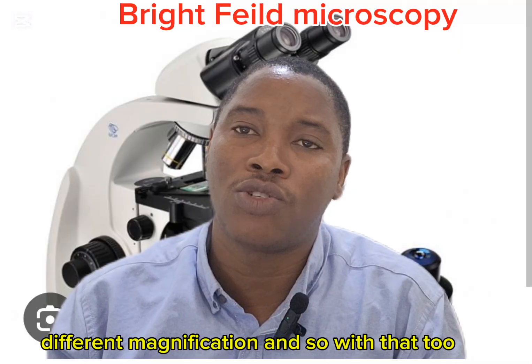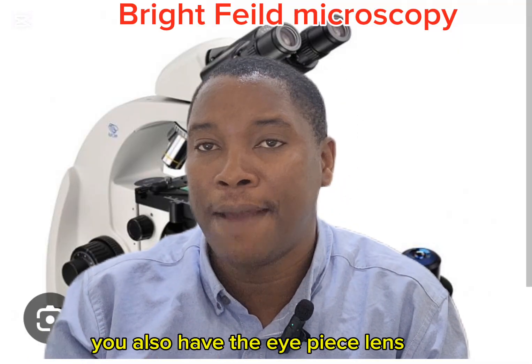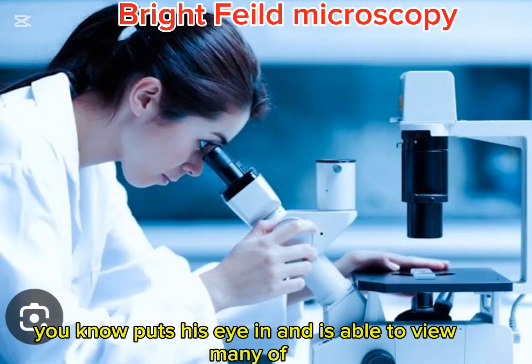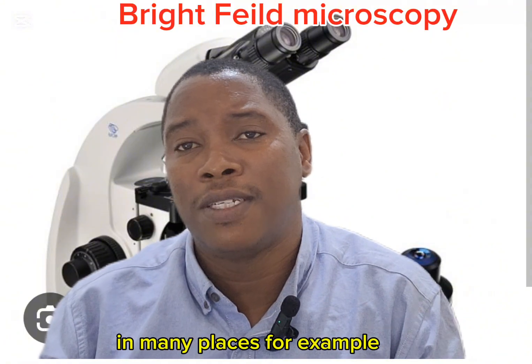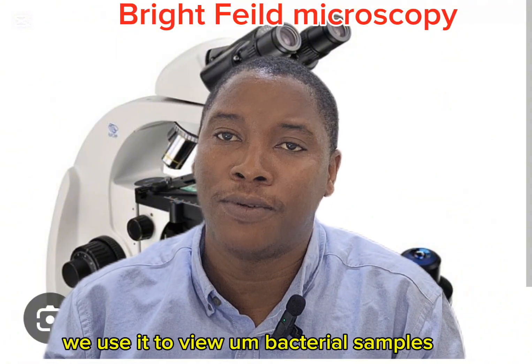Apart from the objective lenses, you also have the eyepiece lens, where the scientist puts his eye in and is able to view all these specimens. So this is very important to use. Where do we make use of this bright field microscopy? In many places. For example, we use it to view bacterial samples.